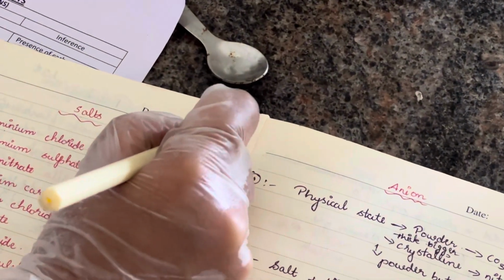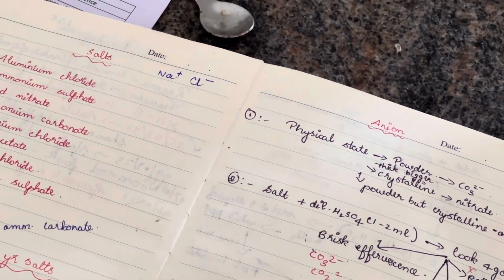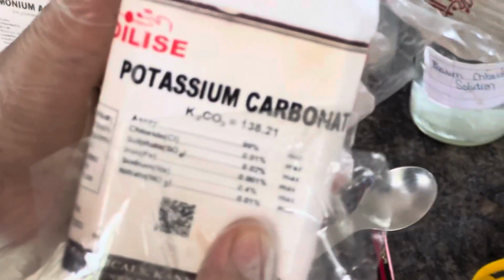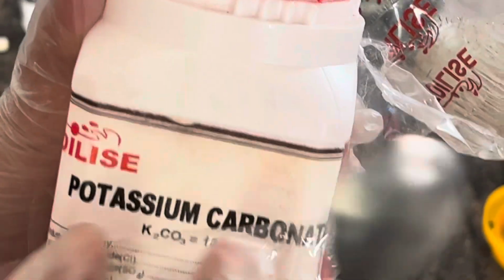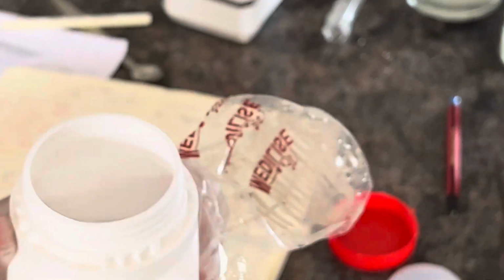See, for example, NaCl. In the case of NaCl, Na is the cation and Cl minus is the anion. Similarly, for every salt there will be a cation as well as an anion. For example, potassium carbonate. In this case potassium is the cation and carbonate is the anion. Okay, so you have to analyze the cation as well as the anion separately. So in this video we'll be doing the analysis of the anion.